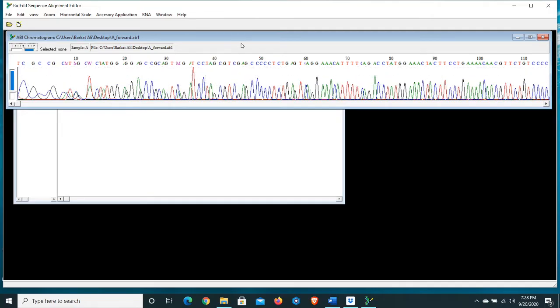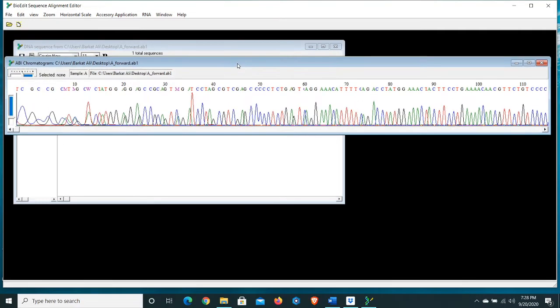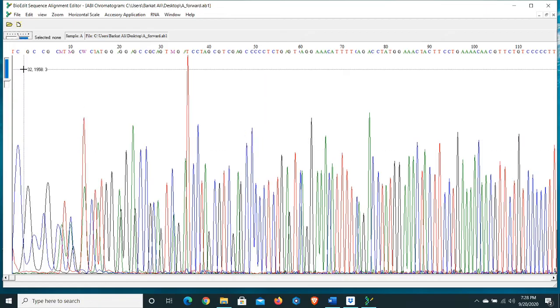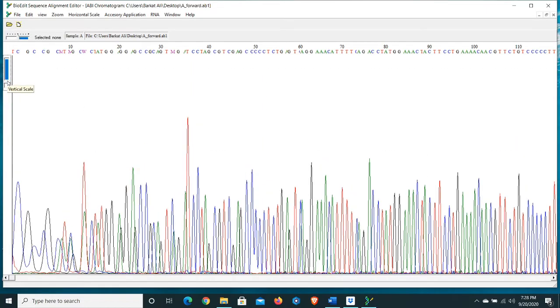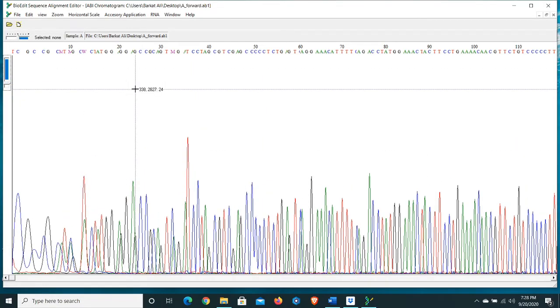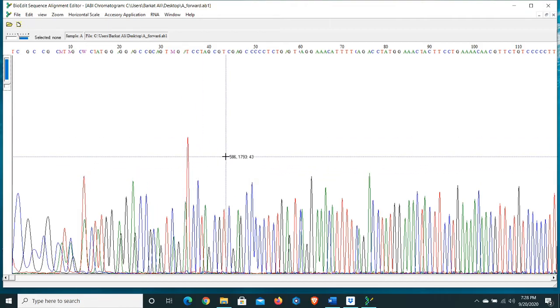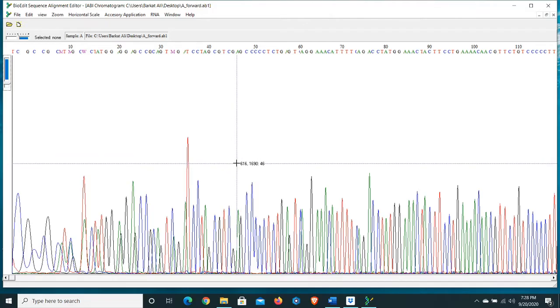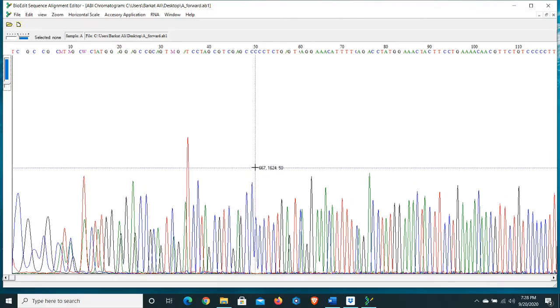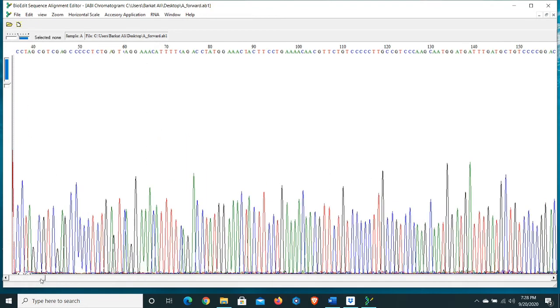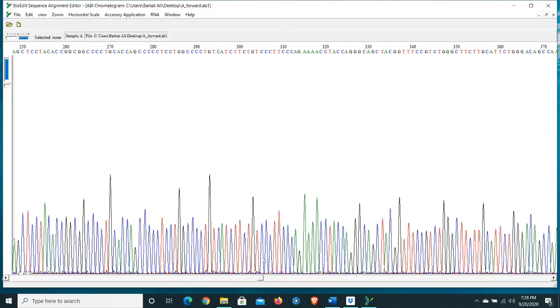Let's open the forward sequence first. BioEdit software is open and you can see on the front of screen the chromatogram of the forward sequence. Let's zoom out so on this page you can assess your sequence.